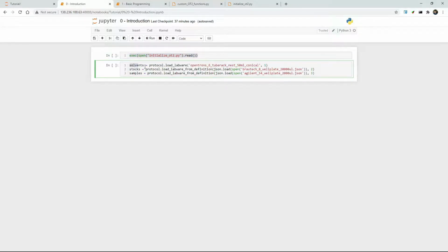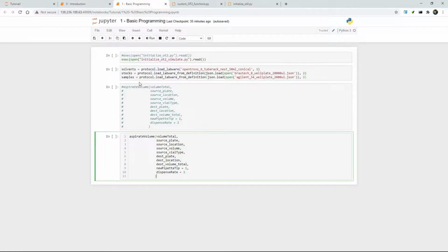And we defined the plates here in the last video. And so now what we need to do is we need to actually get this thing moving. So we'll actually go over here. We're going to add this one function here, which is built in to the code that we've already developed.